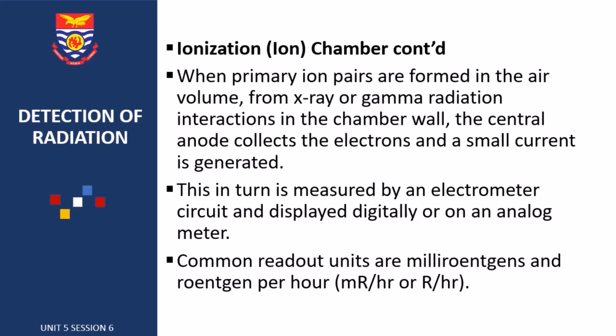The instrument must be calibrated properly to a traceable radiation source, and they are also designed to provide an accurate measure of absorbed dose in air, which through appropriate conversion factors can be related to a dose in tissues. It's good to note that because most ion chambers are open air, they must be corrected for change in temperature and pressure.